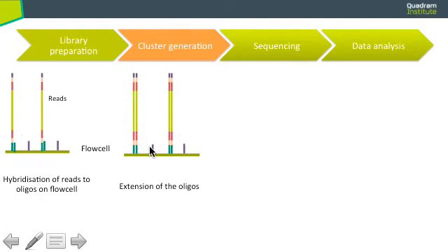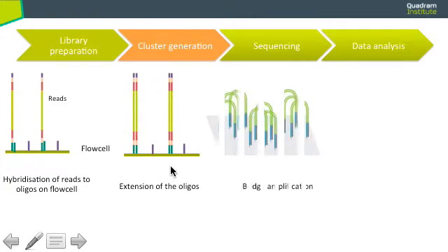The way Illumina works is that it has two different sequencing primer binding sites, called A and B. And what it does is called bridge amplification. So this part of the sequencing binding site will bend. One part of it will get cleaved away, and this part will again bend to form clusters like this. So these are called clusters. This is called cluster generation.